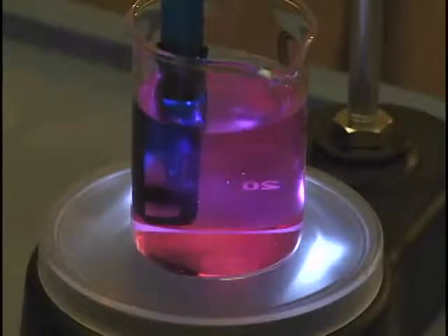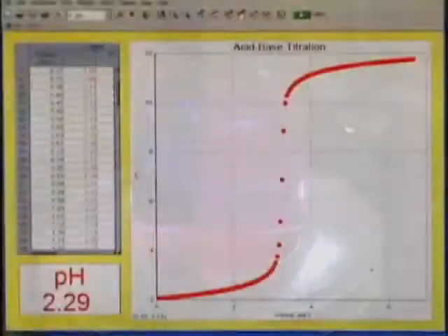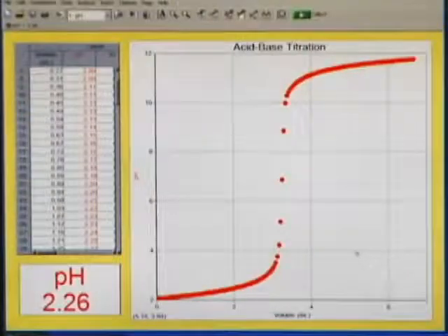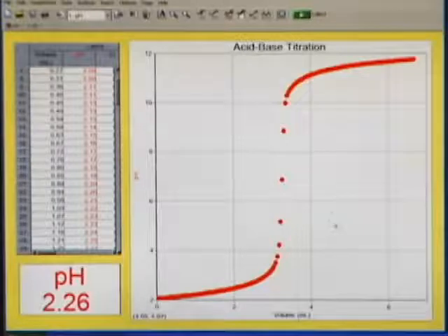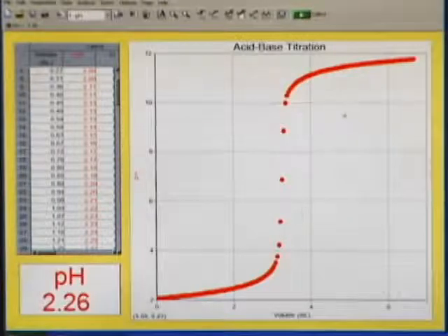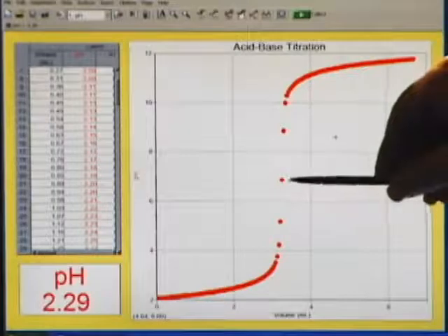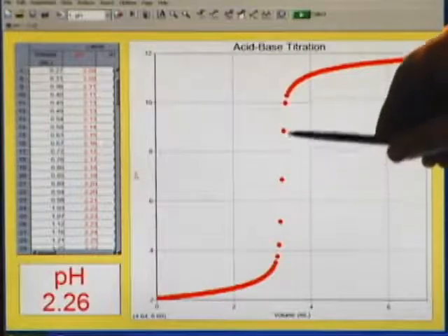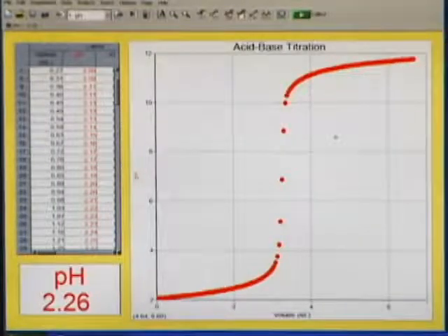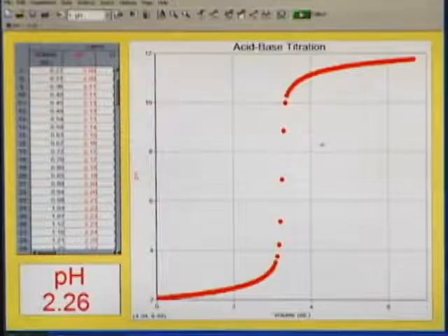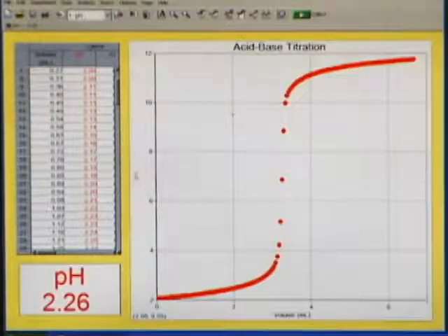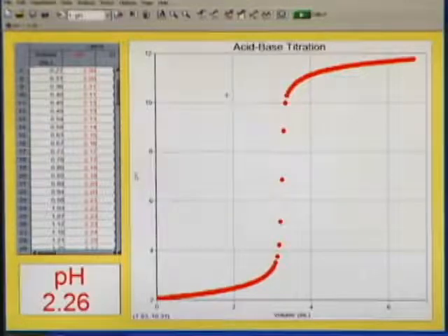So here's our completed titration data. We want to find the equivalence point of this. If you look at this pH data, you can see that probably between these two drops is the largest jump in pH, but that doesn't give us a very accurate reading. So what we would do is find the first derivative of this data, and in the Logger Pro file we've already done that for you on page two.